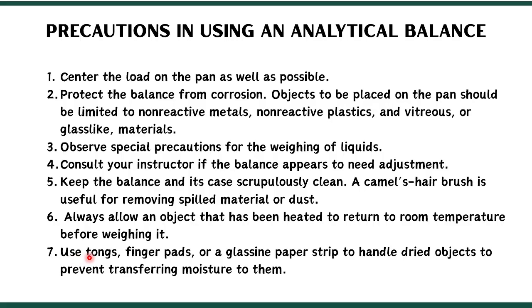Then, we also need to use tongs, finger pads, or glassine paper strip to handle dried objects to prevent transferring moisture to them. So, kung magtimbang ta, dili pwede nga kamot lang ang atong gamiton. Pwede ta magamit og tongs, pwede ta magamit og finger pads, and mga paper strip. Especially if mga dried object na sila, because naa na possibility nga ma-transfer ang moisture nga naa sa atong kamot or sa atong palm dito sa object na atong timbangon.